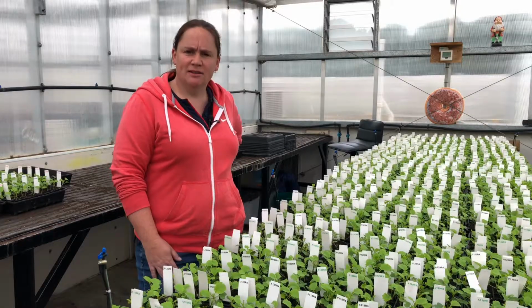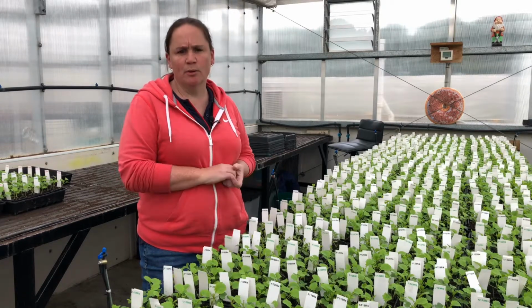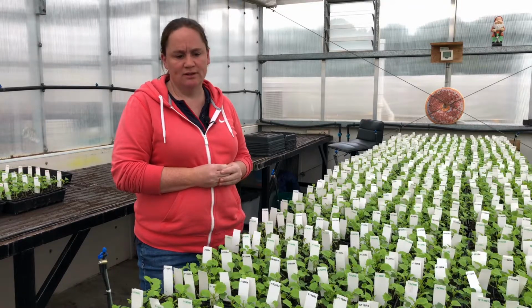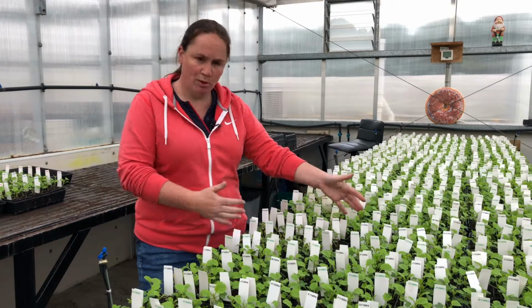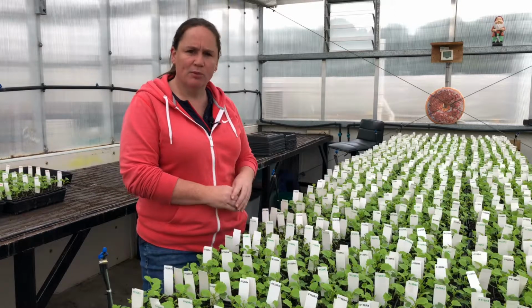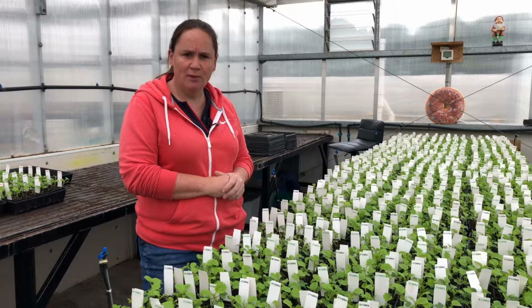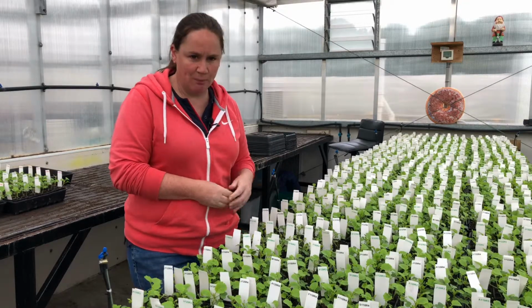Okay, so 15 days later, after we do the inoculations, we come back and we score the plants. What we're looking for is lesion development on each of the different chemistries. Each one of these trays is one stubble population that was in one of those tubs that you saw earlier in the video. And each half punnet represents a different chemistry. So we're going to go through and look at what lesions develop, and that's what gives us an indication of our fungicide resistance. I'll show you one of these up close.